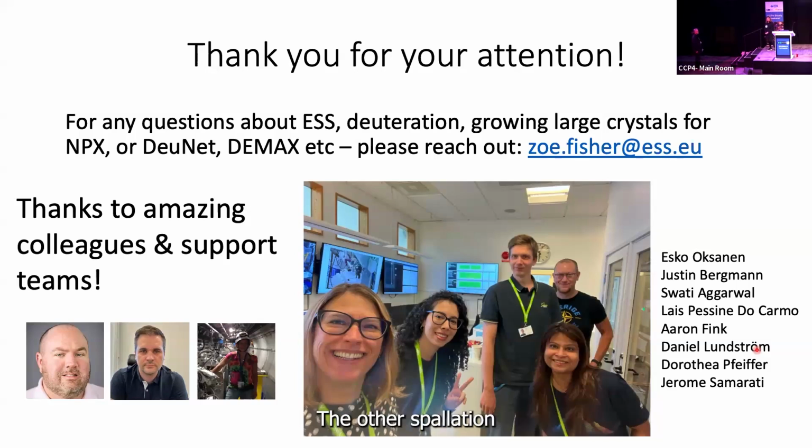At Oak Ridge, the other spallation source that does TOF Laue, they use Mantid and other things for their data reduction. So I think at ESS, we have a team of people working in the data management software center that are working on tools to do this. That makes sense. But yes, that is a way to reduce the data collection time.